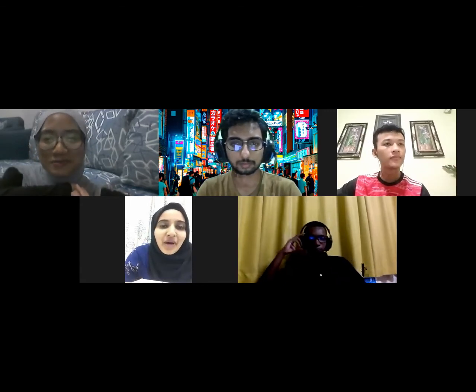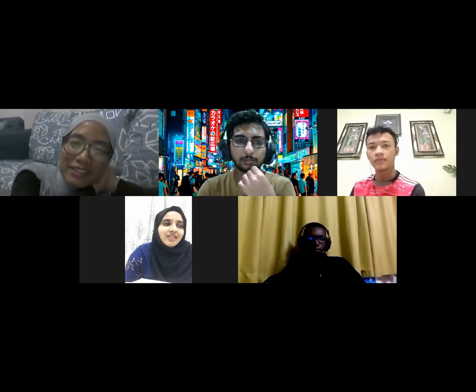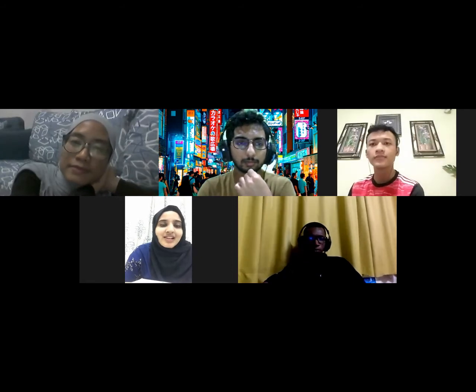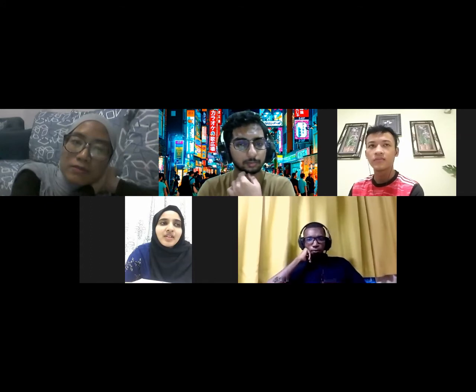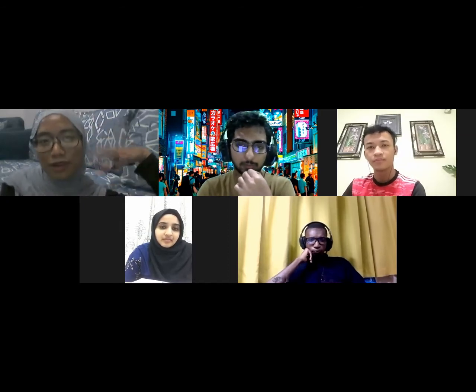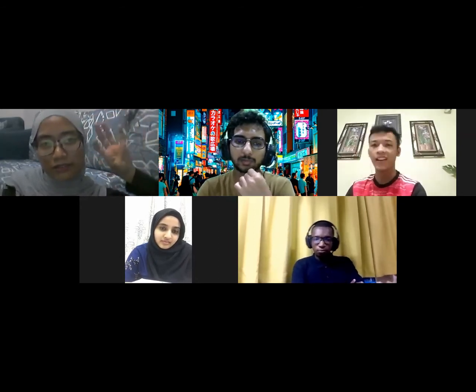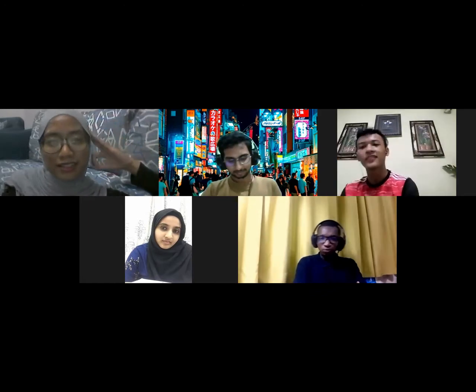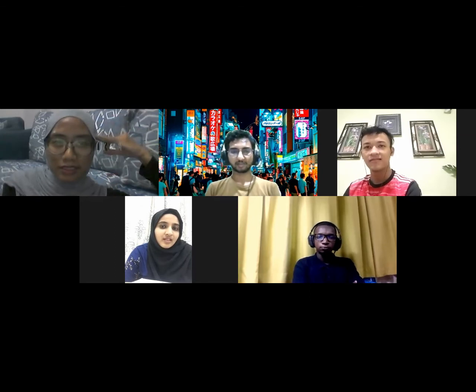So basically for our assignment, we are given a task to design a primer. So let's start on how we determine a good primer. Like how do we know whether it's a good primer or not? When designing a primer, there are a few criteria: GC content, GC%, primer length, optimum TM, and stability of the 5' and 3' ends.